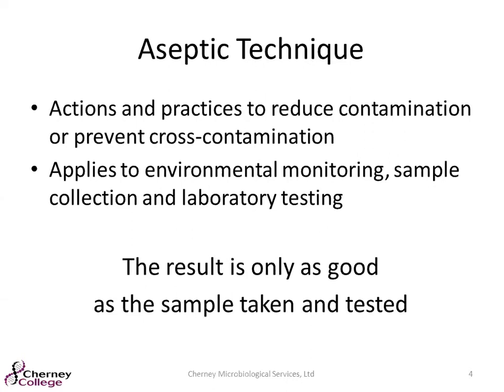So it's a very wide-encompassing thing that you really want to think about start to finish. Key takeaway: the result is only as good as the sample taken and tested. Again, we'll talk about that beginning to end, reiterating that as we talk about sampling, it's not about taking the easy sample, but taking a really good representative sample.